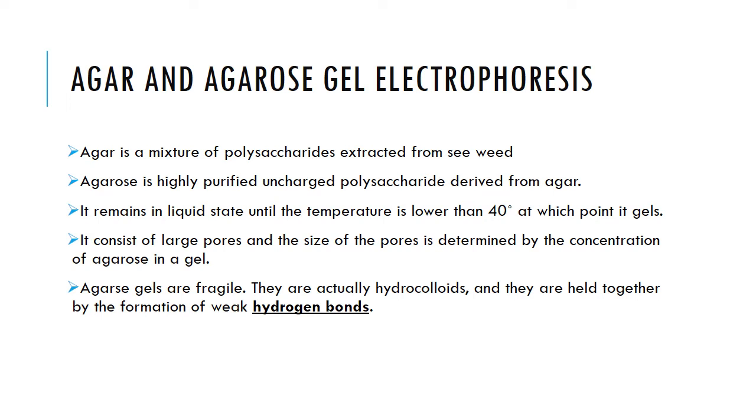When you talk about the agar, this is simply a mixture of polysaccharides extracted from seaweeds. Agarose is a highly purified and uncharged polysaccharide derived from the agar.